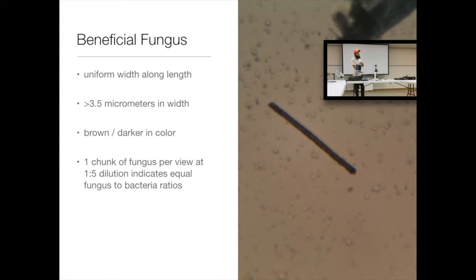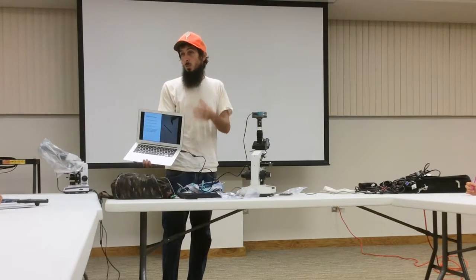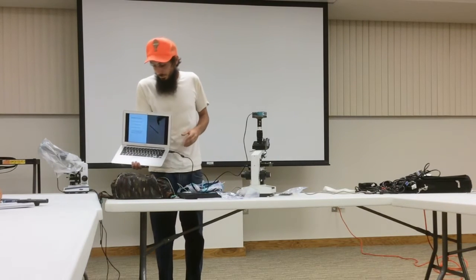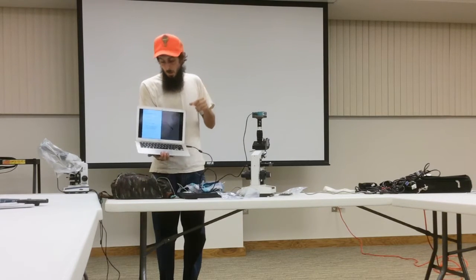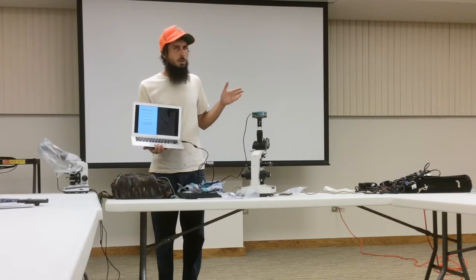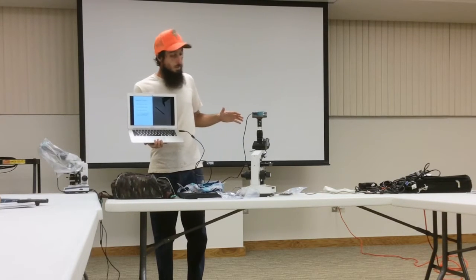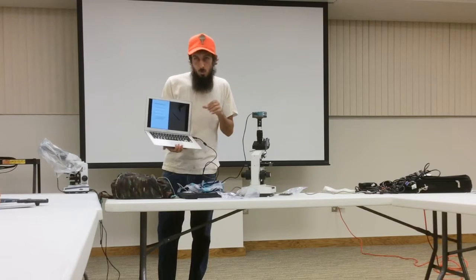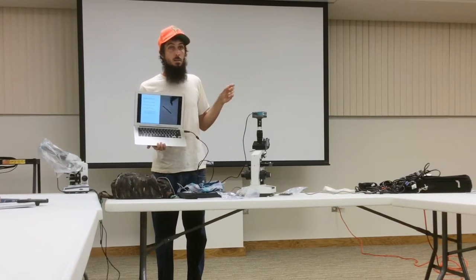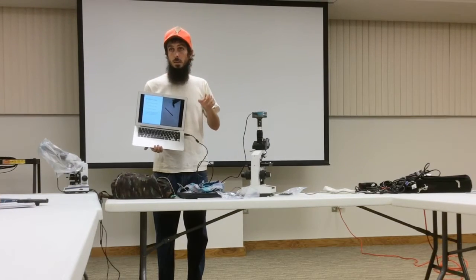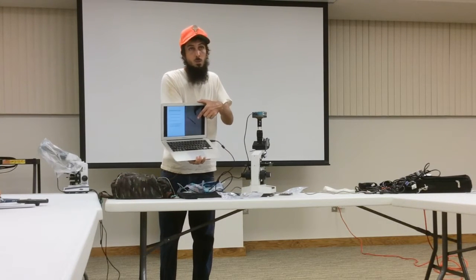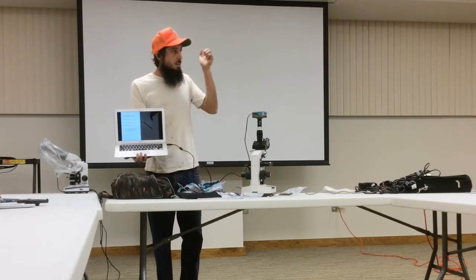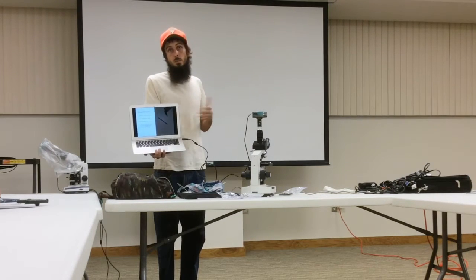Beneficial fungus are what I'm most focused on. These are the organisms that restore oxygen back to the soil, and when I'm looking through the microscope, that's what I'm trying to see to determine the health of my soil and whether my inputs are working. Beneficial fungus appear as parallel tubes in the soil, darker brown in color. Parasitic fungus are clear, whereas beneficial fungus are darker colored. They're also wider than 3.5 micrometers — they tend to be wide in the soil and may break into chunks but will always be really wide.